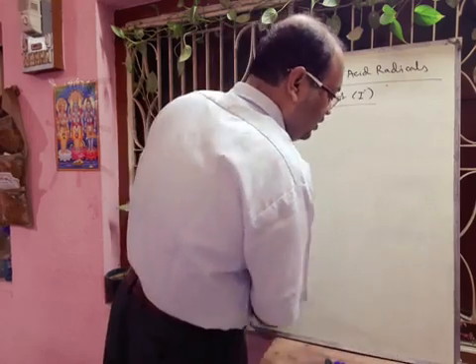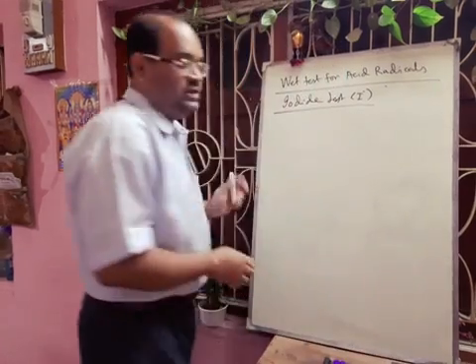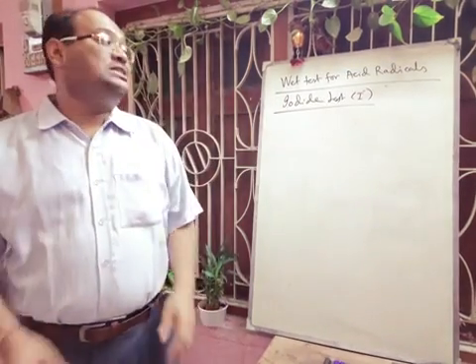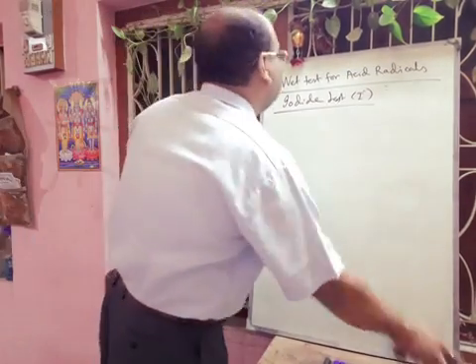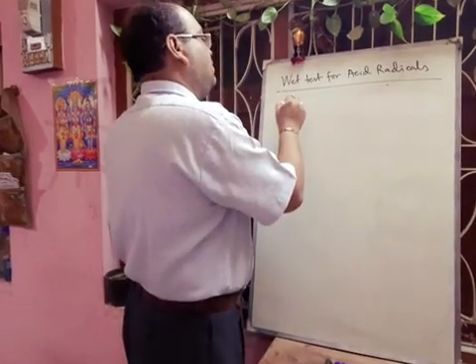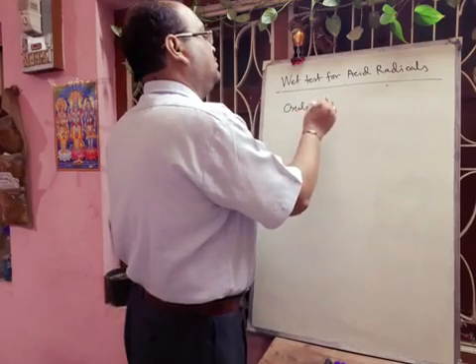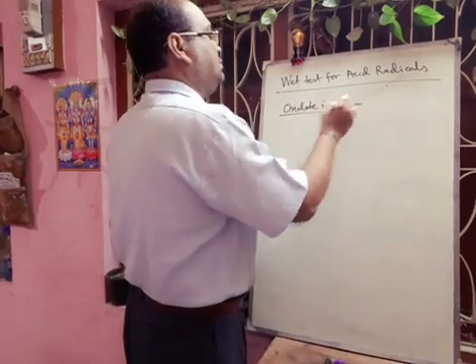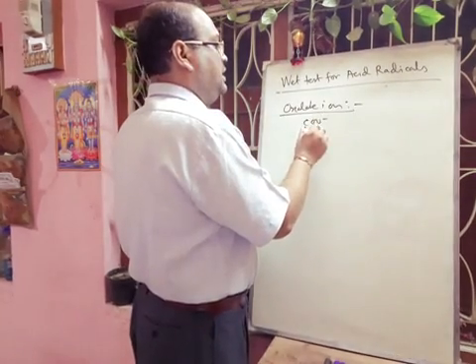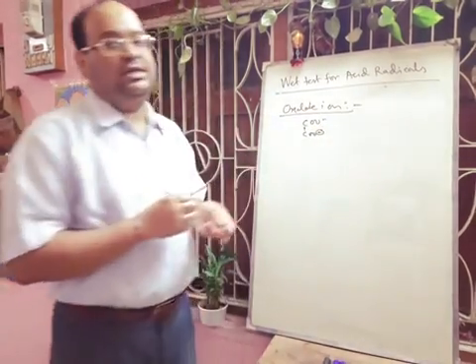And in the case of chloride, you can also perform the chromyl chloride test. Next we will discuss the oxalate ion. Oxalate ion is COO⁻, COO⁻. That is the oxalic acid anion, the oxalate ion.